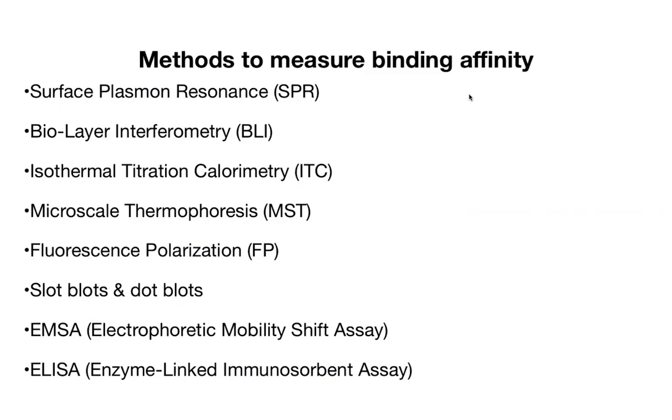So I hope this helps you approach your papers and not be scared off by these big terms. They're all doing fairly similar things. That is, we're measuring binding affinity and/or kinetics.